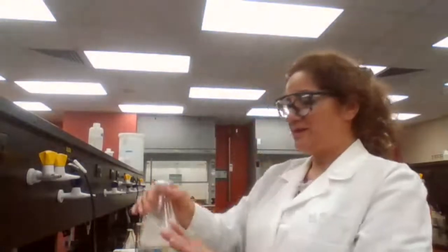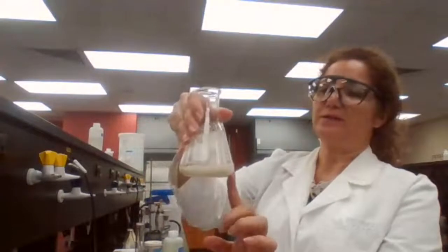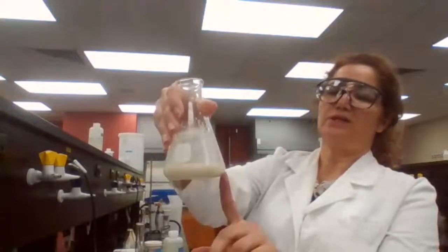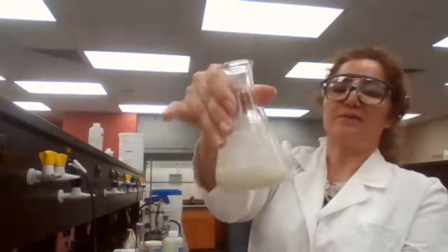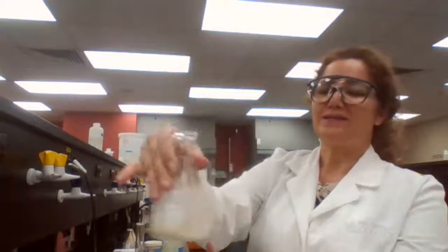Now we have the product, and in the same reaction mixture, I'm going to add my crystallization solvent and crystallize this crude product. My crude product should have a lighter, more white color. Instead of white, it now looks more like a tan color. So I need to recrystallize this to make sure that I'm getting the desired color.